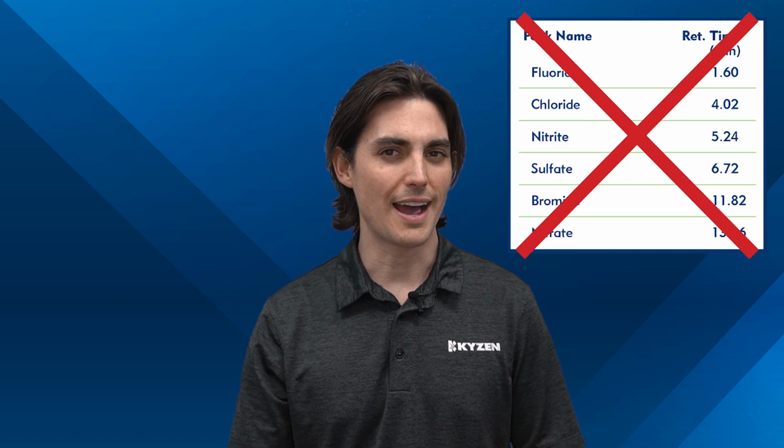But I digress. What do we do, though, when we get results that exceed our limits? If you have issues with high IC data, stick around, because today we're going to be talking about the best practices in troubleshooting for getting the most accurate IC data possible.